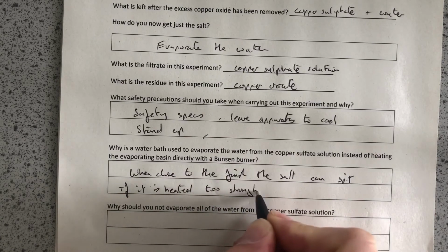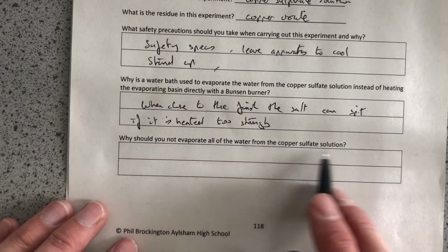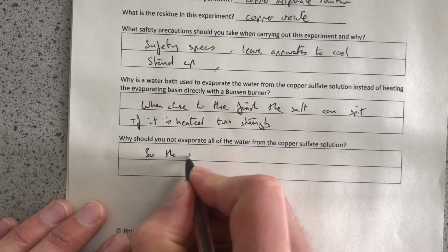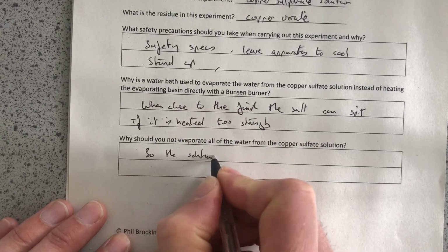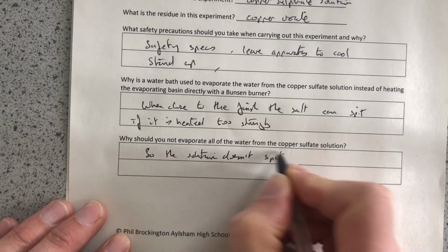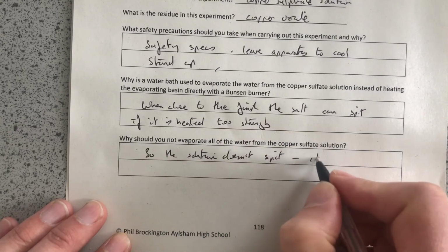The water bath is a gentler way of heating it. Why should we not evaporate all of the water? For the reason I've just said. So the solution doesn't spit. It keeps it safer.